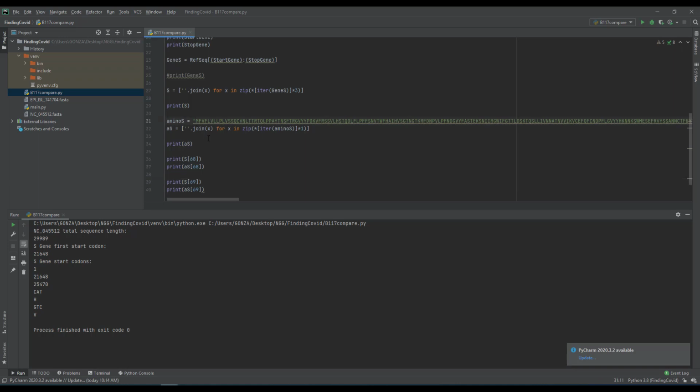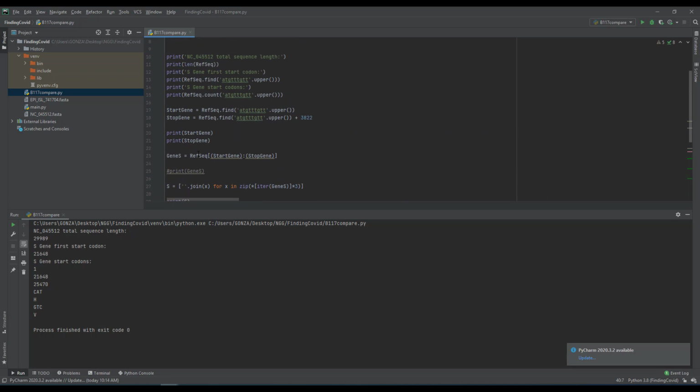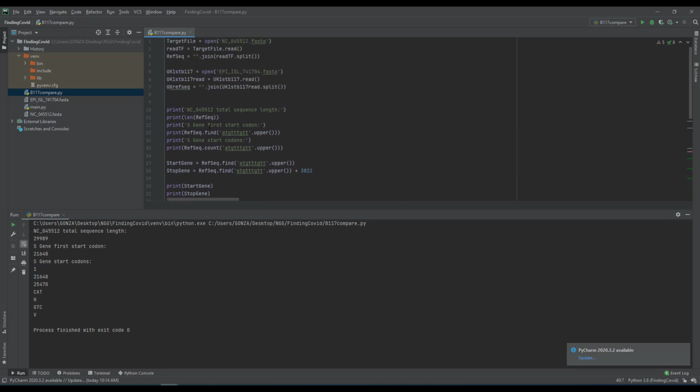So what you could do here is put an X or anything to make it 1 bigger, and it'll line right up with 69 and 70 if that's what you need. But in this channel we understand computer code just fine, and that it starts with 0, so we're going to start 1 back.